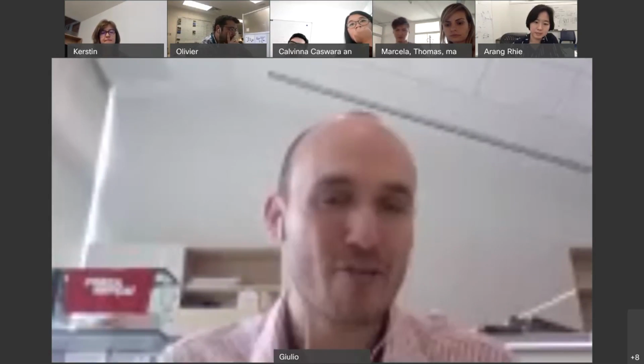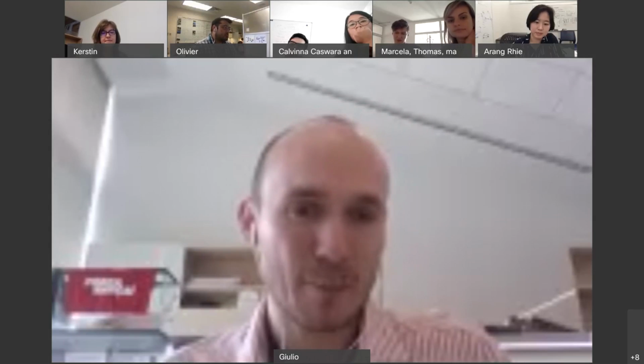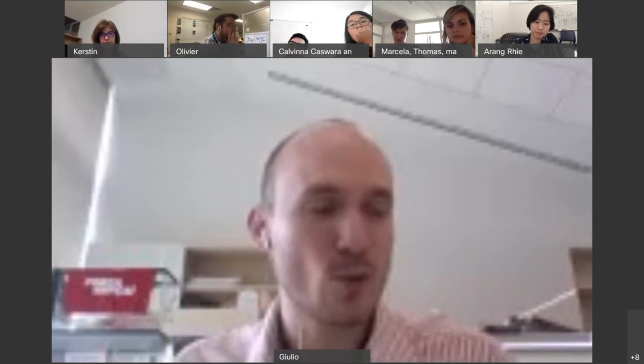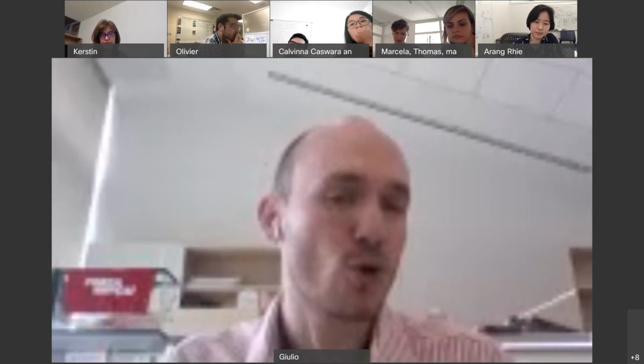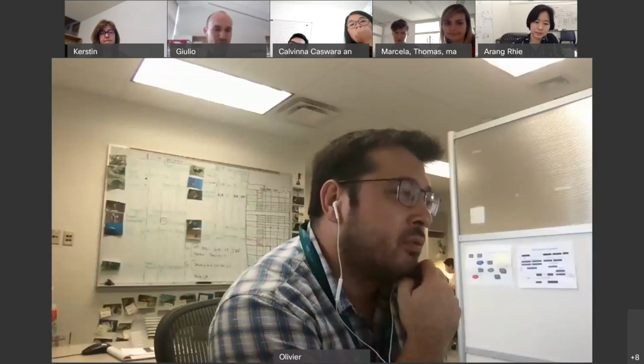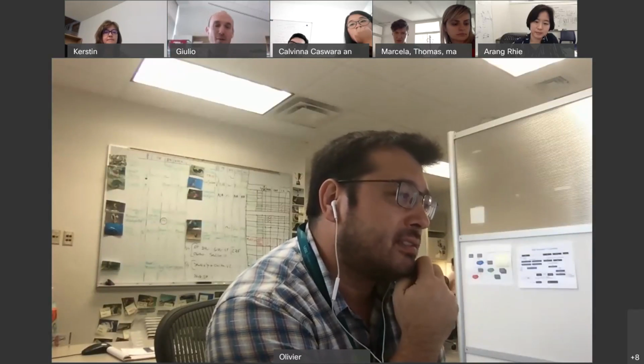Of course, it increases the runtime, because then you have to map everything to a much larger reference data set. But it will also be the most appropriate way to look for cross-contamination, or, as you said, parasites or whatever else. The mapping time is not that bad. I tried on a data set with 700 mitochondrial genomes, and you map PacBio data very fast. Yeah, I mean, they are small, so it should work anyway.